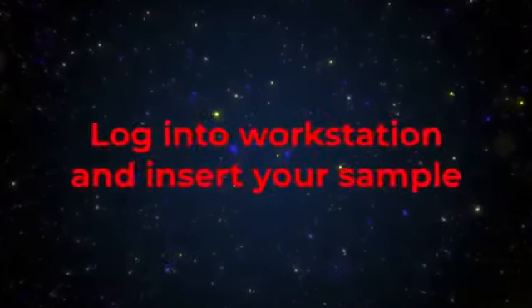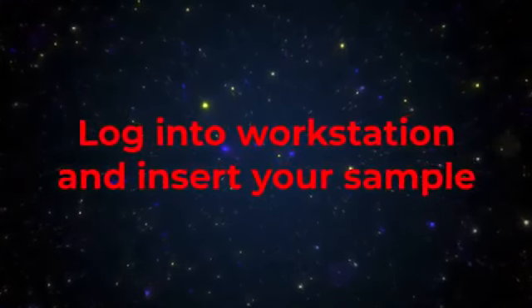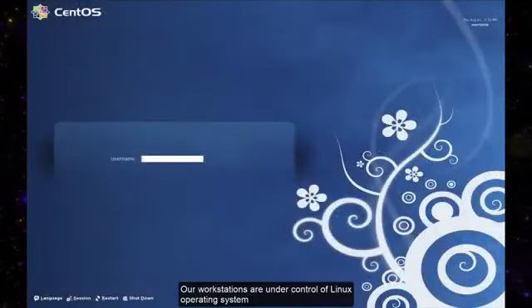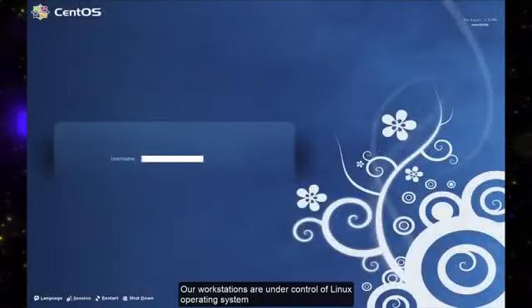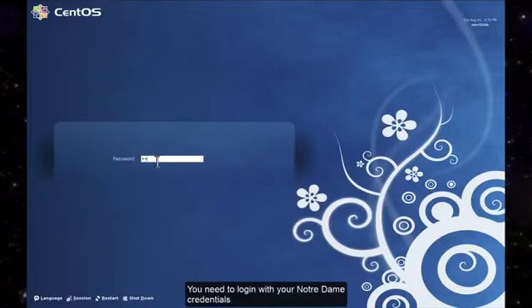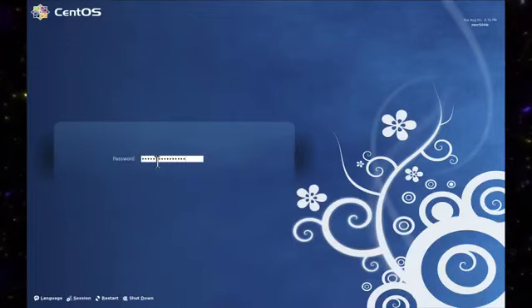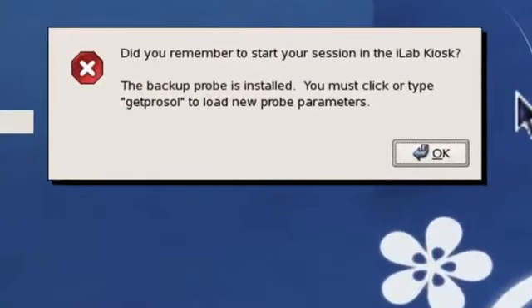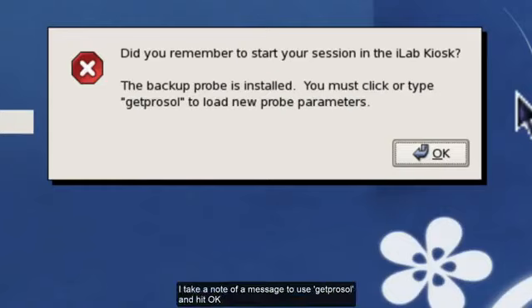14.1 T, etc. The resonance condition: NMR occurs when nuclei are irradiated with radio frequency, RF, energy that matches their precise Larmor frequency. This is the resonance in NMR. Applying an RF pulse at frequency nu causes nuclei to absorb energy and transition from the low energy to the high energy state, a spin flip. This absorption of energy at a specific frequency is the fundamental event that is detected.